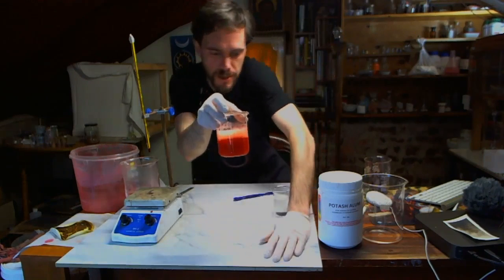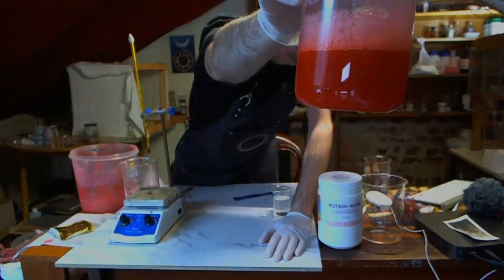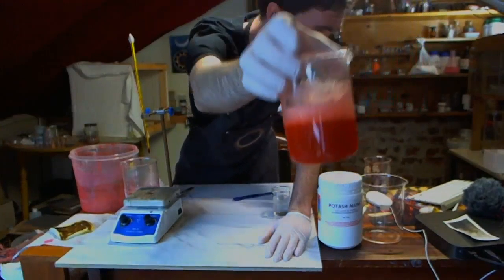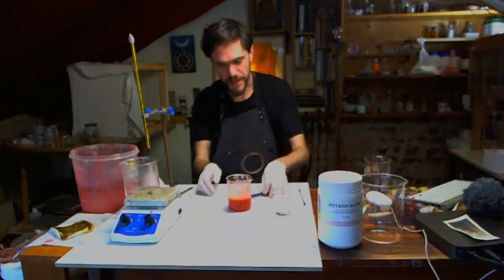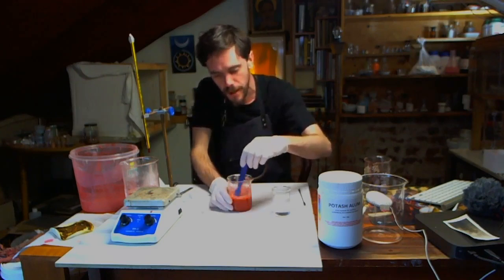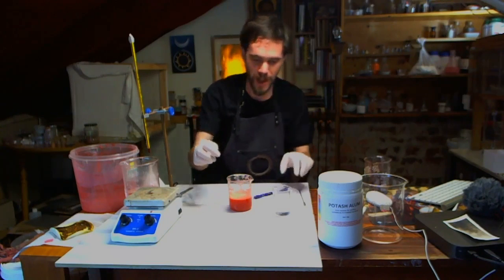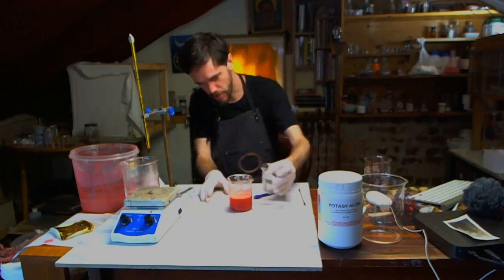Let's try and get this closer to the camera. Oh, it's so hard to see. I wish I had a slightly better camera setup, but anyway. Okay, so that's interesting. Having both solutions be hot definitely makes the froth go away quicker.